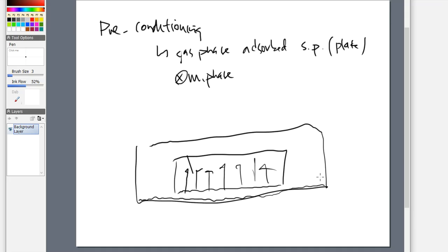Nothing's moving through the stationary phase. No travel is going to happen. The only thing that we're doing is allowing the gas phase to latch on to the upper parts of the plate, to create something that's a little more uniform, that already has the gas phase ready to go, and maybe, just maybe, this will help my separation a little bit better.